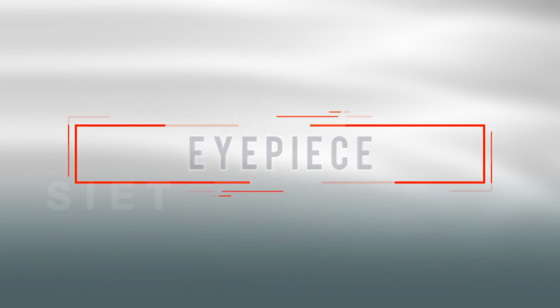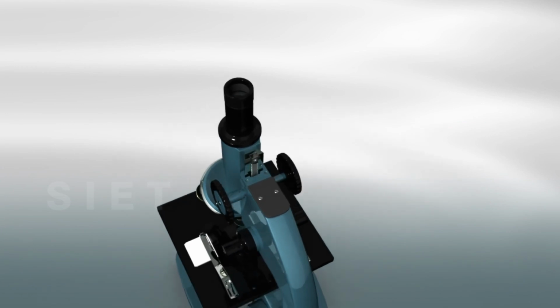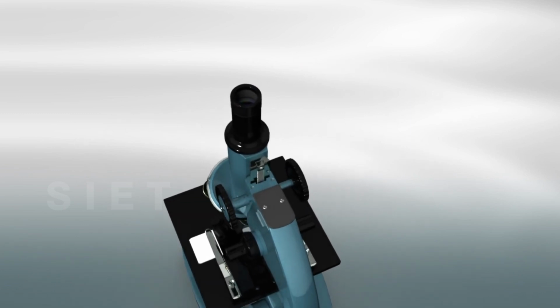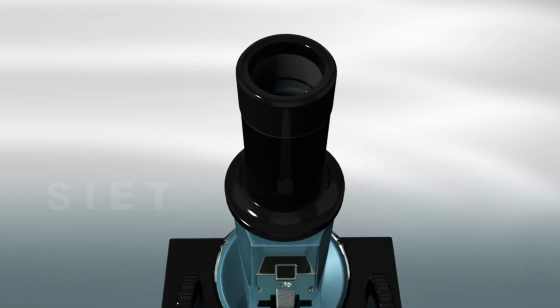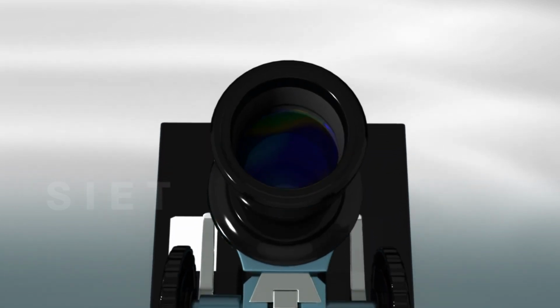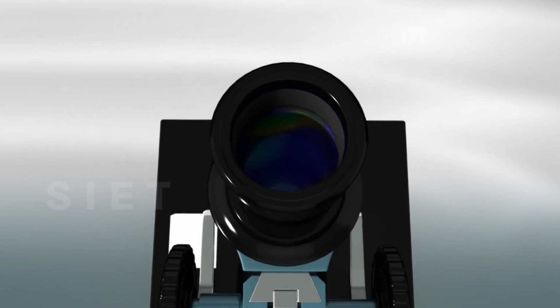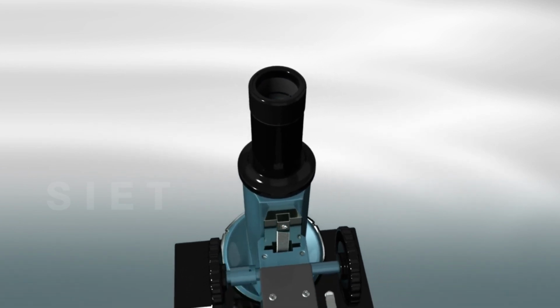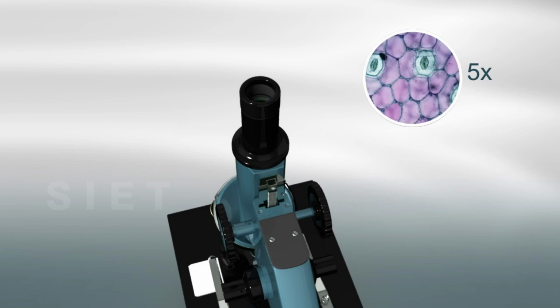Eyepiece. This is the part of the microscope closest to your eyes through which you look. It contains the ocular lens, which makes the image produced by the objectives larger. The eyepiece may be labeled with its magnification or power, for example, 5x or 10x, which means it enlarges 5 times or 10 times.